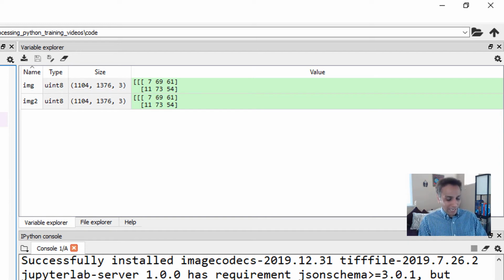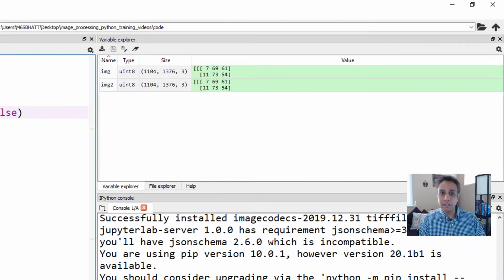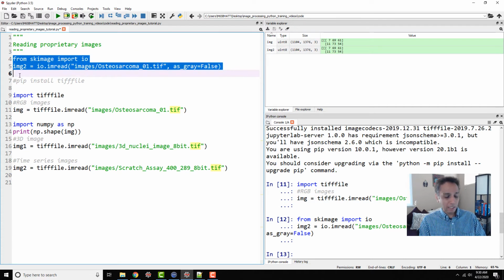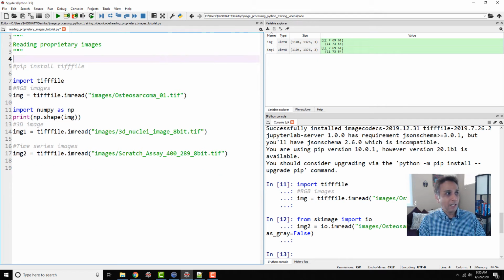Now, by the way, scikit-image is actually using tifffile in the backend when the extension is TIFF. Please go ahead and look at the documentation for scikit-image io. You'll see exactly the same statement: when you read or write TIFF files, it's using the tifffile library in the backend. But it's not actually doing advanced stuff.